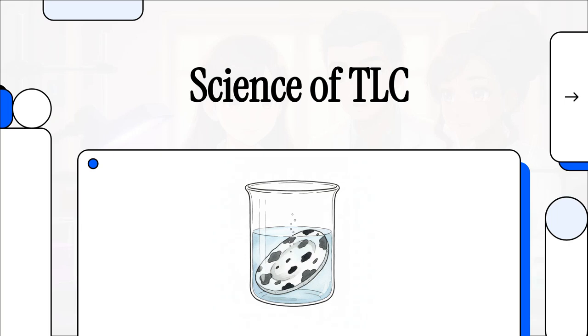All right, let's just dive right into this explainer. Today, we're uncovering the absolutely fascinating world of chemical separation. We're going to be looking at a complete lab experiment originally presented by Dr. Chem that focuses on analyzing drug components using thin layer chromatography, or TLC for short. Basically, we get to play lab detectives today and see exactly how scientists identify completely unknown substances. It's kind of like magic, but science.